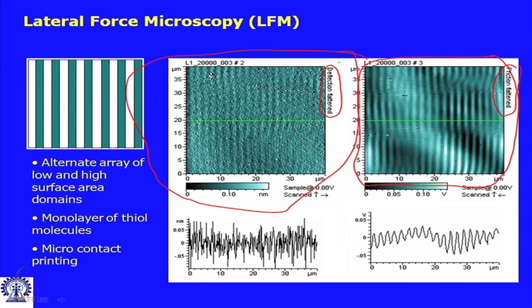What you need to understand is how this friction image has been generated. It has been rendered in brighter and darker zones. What you cannot say, looking at this image, is whether the brighter zones or the darker zones correspond to the gamma 1 areas or gamma 2 areas.